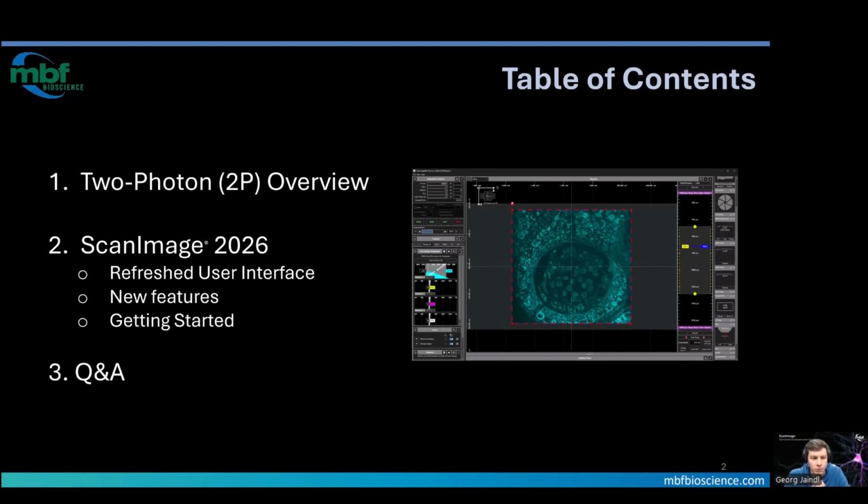We'll show you the new user interface. We'll talk about some exciting new features. Then we'll also give you some pointers for getting started with the new version. And at the very end of the webinar, we'll have time for a Q&A session.